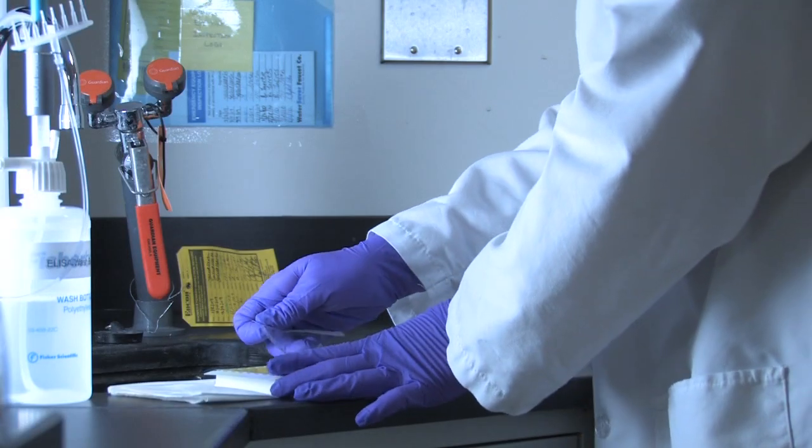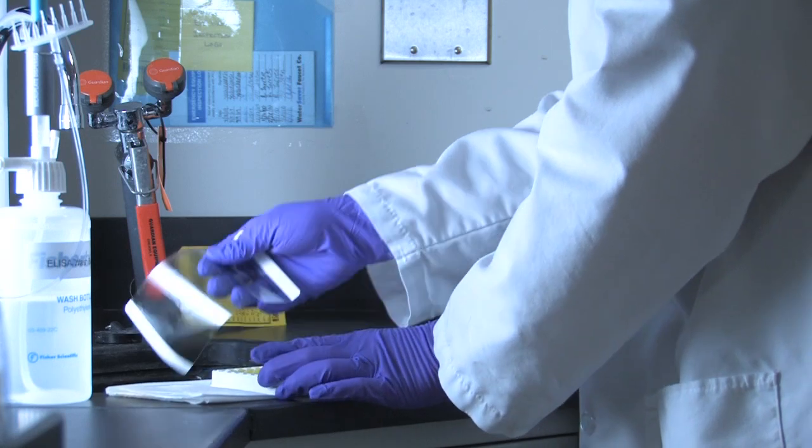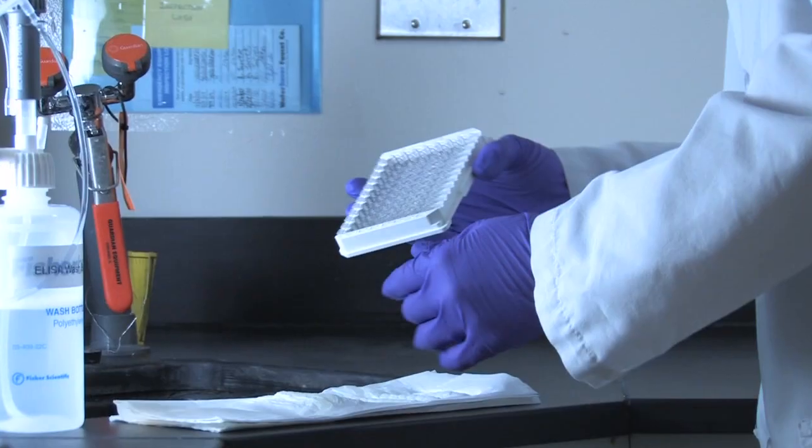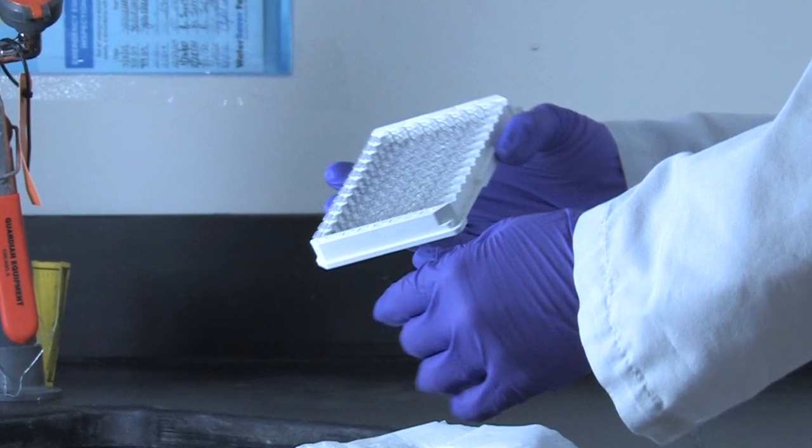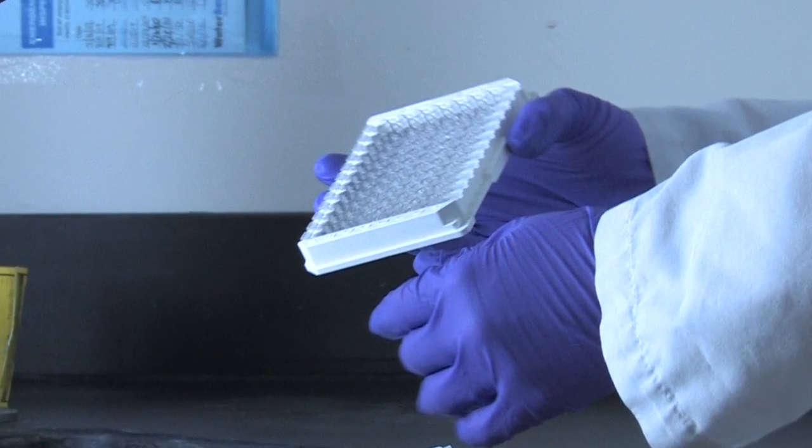If necessary, remove the plate sealer or covering that was used in the previous step of the assay. Firmly grasp the center tabs of the plate frame to ensure strips will not fall out of the frame during discard and drying.